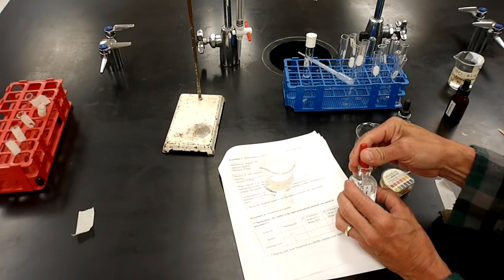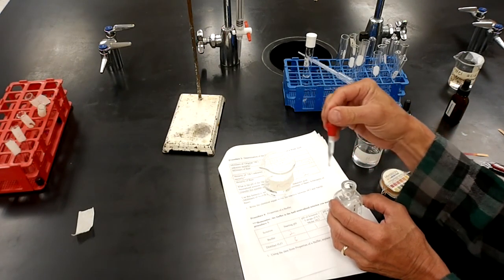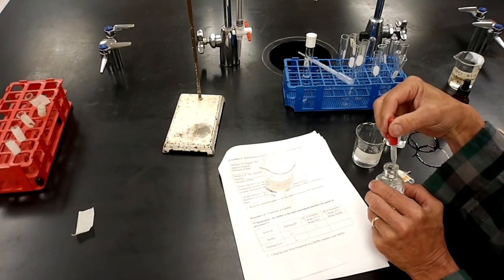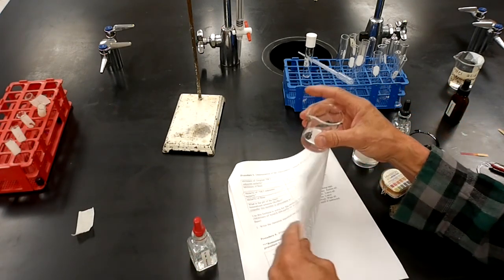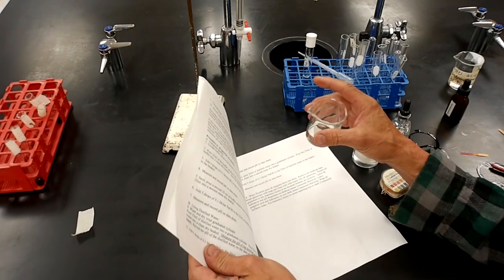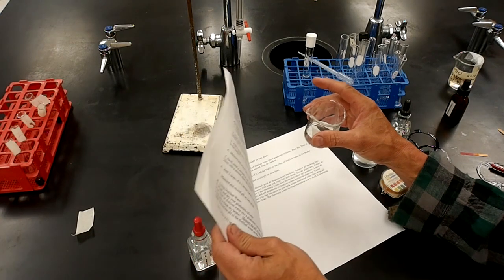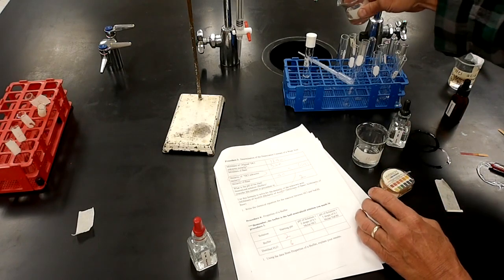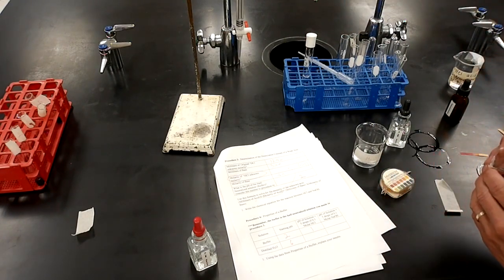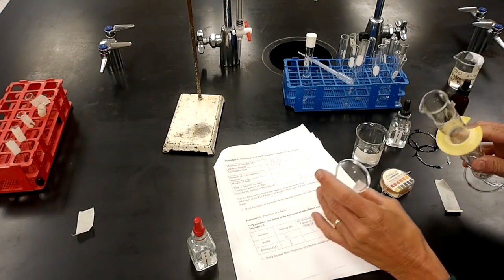Now I'm going to take some sodium hydroxide. I'm getting another 25 milliliters of the buffer.